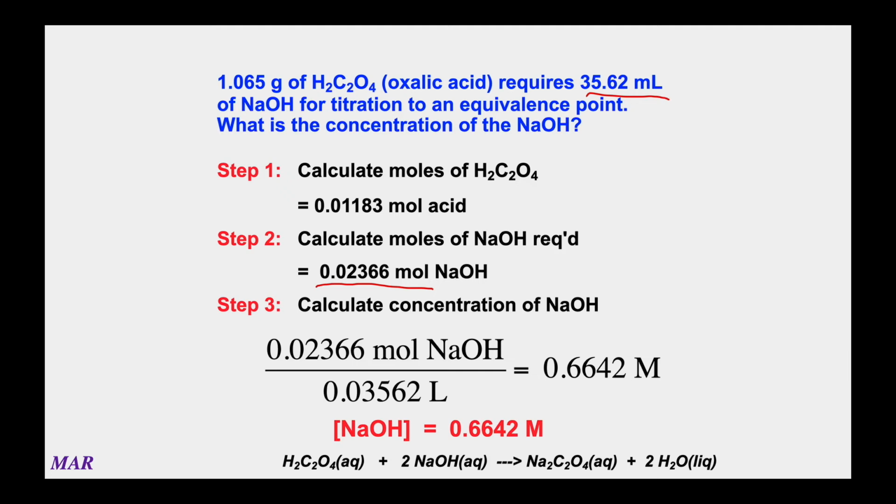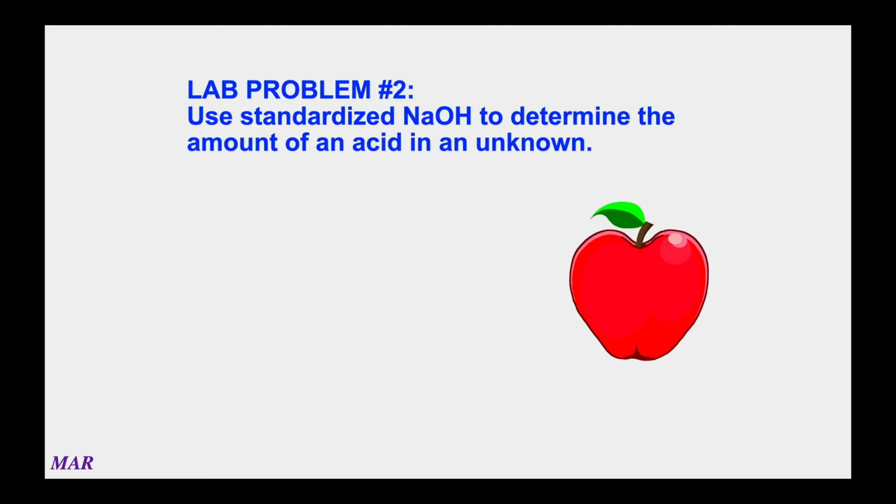Also, if you've had a solution sitting around in the stockroom for a while, it's nice to go through this kind of process just to verify that the concentration is about the same. So you can also use this to see if the old solution is still the same or has degraded. Oh, the tricks of chemistry. So let's say we have that standardized sodium hydroxide, and standardized just means that you have confirmed to many sig figs what the concentration is.